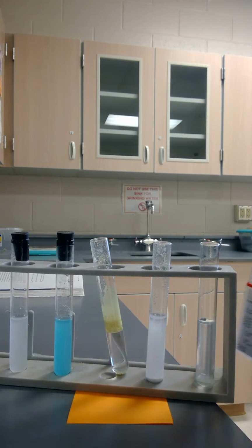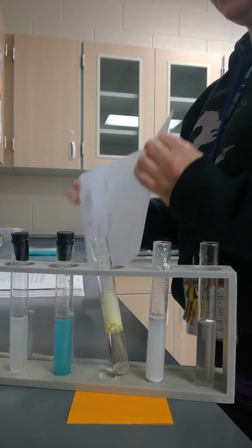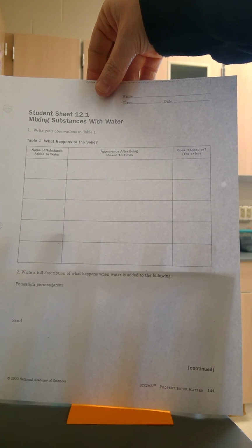Take a look at your chart again. You should have documented the name of each of those, the appearance, your observational properties, and then identified yes or no. Did it dissolve? You can go ahead and cross out this bottom section. We did the sand already as our pre-lab, and you should go ahead and staple this paper to the front of your lab book, page 33. Thank you.